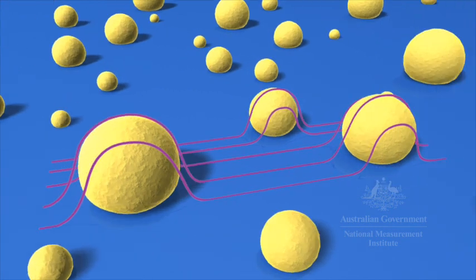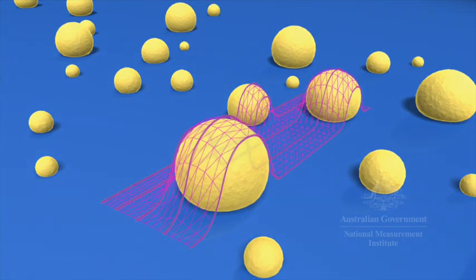The resulting map of tip position can then be processed to render an image of the sample topography with nanometer resolution.